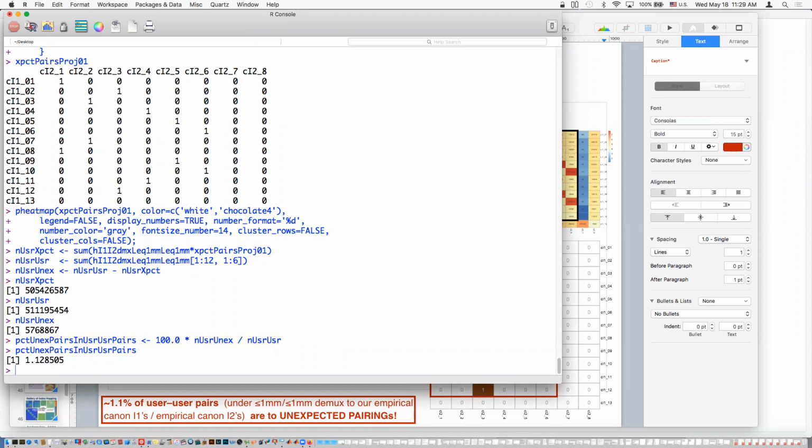Usually, it's fairly bifurcated. There are lanes that are kind of around this level, and the rest of the lanes, which is most lanes, is probably 10 times lower. It's like 1 in 1,000. Probably that's closer to normal. But it's not totally random. For example, same lab, same type of libraries, same people prepping, similar offerings. It is related to the material. It's not completely random.